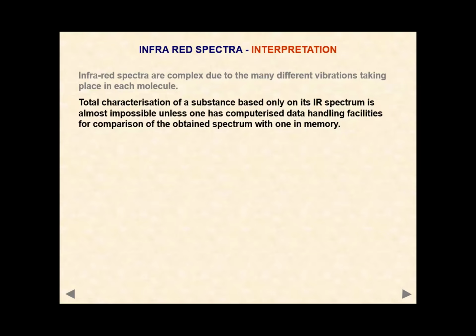We connect the data system with the spectrophotometer. So when the different covalent bonds absorb different types of infrared radiation, they are going to vibrate at different frequencies. That frequency is read by the spectrophotometer, and then that frequency goes to the data system, and it is going to be analyzed.